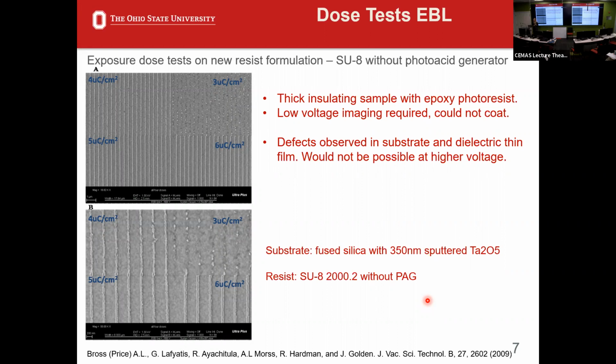That's in our SEM course. Well, we have two different courses, with different labs. One that wanted to do a little bit is the semiconductor lab. That's a great idea. It's nice having Maria here. I can give her ideas of stuff to do, and she can work on them as well. That's great. Well, we'd love to help. It'd be fun. Cool. I'd also like to send my users to you guys. Because training people to use SEM who are not microscopists is a different kind of challenge, right? You're trying to train people to get good images and understand what they need, but maybe not necessarily understand all the things you're talking about now. So it's definitely a different kind of challenge for sure.